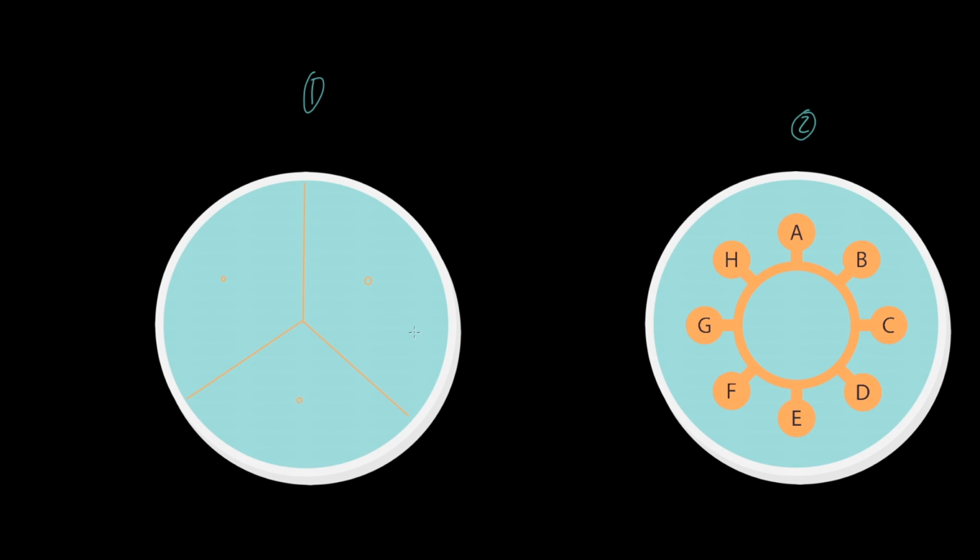Now, the only other thing, and I'm using very much creative license here, is that we're actually viewing example number 1 from beneath. We're going to take a wax pencil, and as you can see here, we are going to separate the plate into 3 approximately equal sections. The other thing is we're going to prepare a little circle in the center of each section, and finally we're going to put our initials.